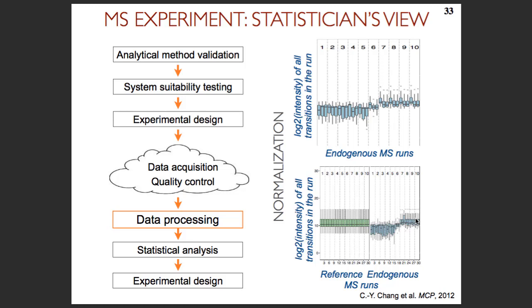And now for the background of this, this was a targeted experiment with yeast, and the targeted analytes were selected because they were expected to change. So clearly a lot of this would have been biology, but because there's so much change without the standards, it was really difficult to know if it's biology or technology.